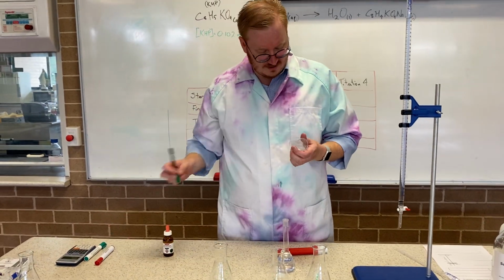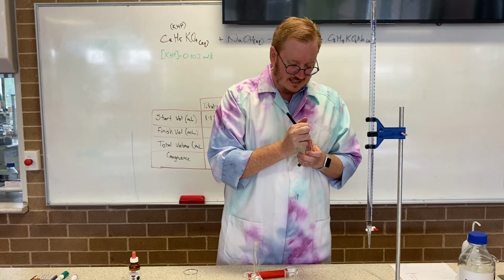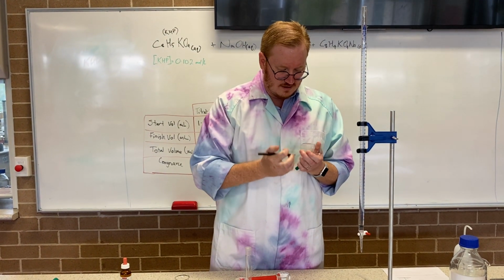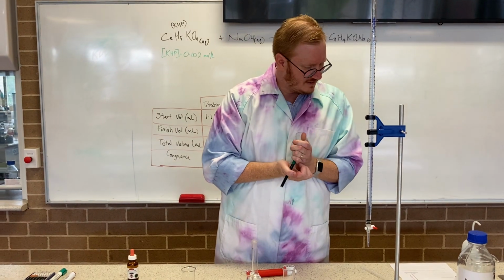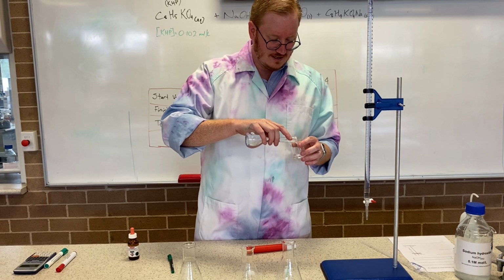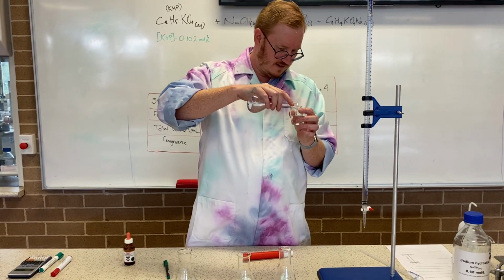Oh, I better label this. Lots of clear solutions to keep track of. KHP. Good. Ow, stabbed myself. Alright, now I can put some KHP in. I want a fair amount.